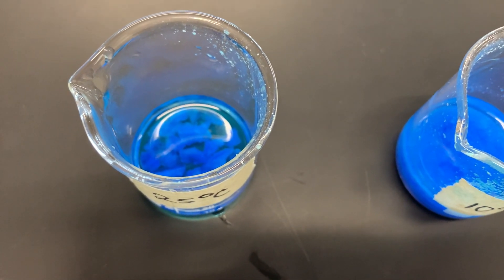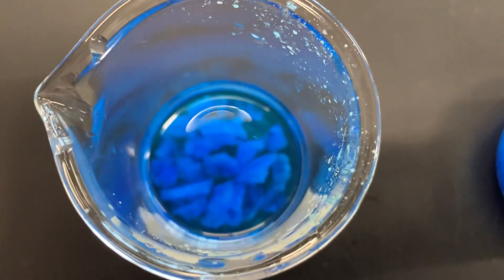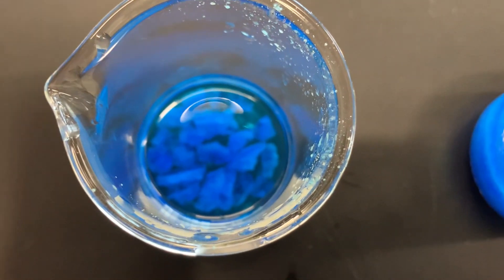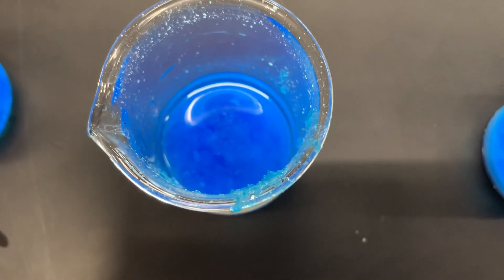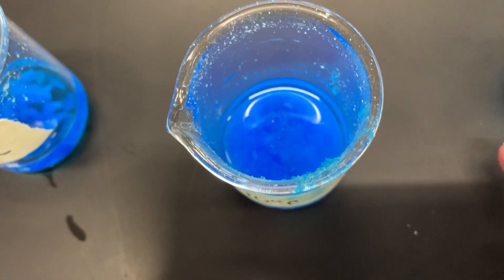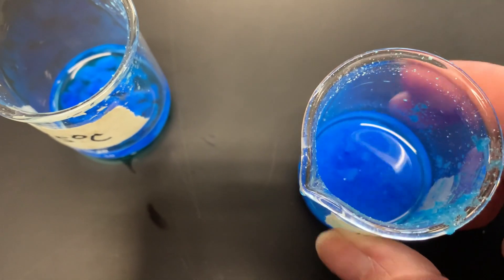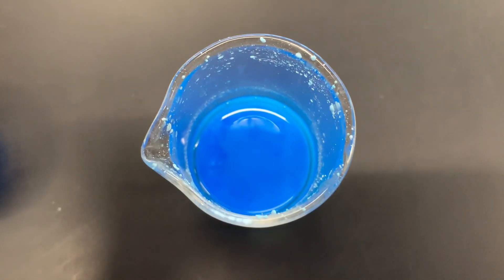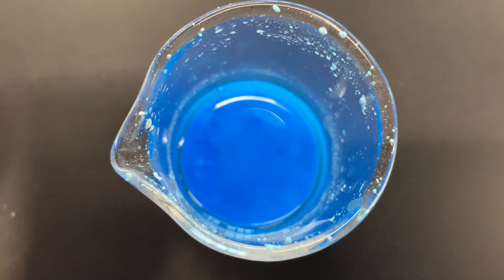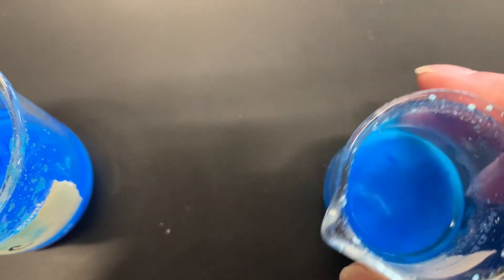At 25 degrees Celsius, you can see that the crystals are rather large. In the 10 degrees Celsius one, the crystals are smaller — a little bit hard to see, but they're in there. In the zero degrees Celsius beaker, you'll see that the crystals are very, very small and very fine — you almost can't even tell; they're about the size of grains of sand.